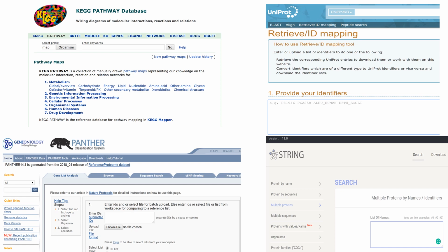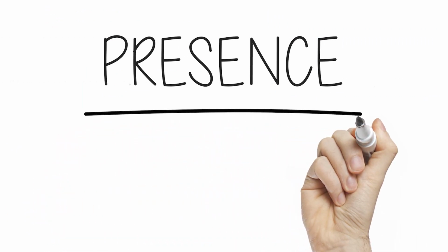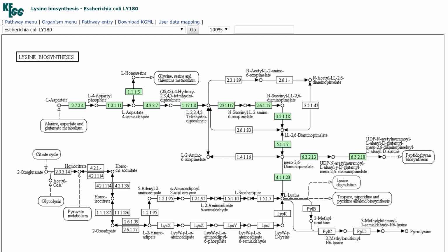The following two proteins I'll be talking about were only found in the treatment group and not in the control group, which means they were significant in our analysis, because whatever treatment was done to the sample, it was causing them to express that protein involved in that particular pathway. Now let's get to it.